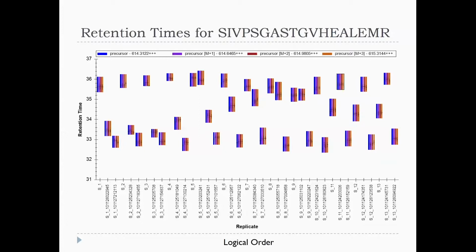Why? Yeah, wow, like the variance in retention time. Boy, what was going on with that chromatography, right? Anybody have a hypothesis?